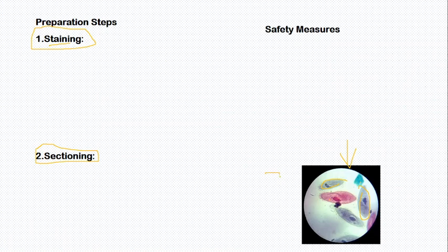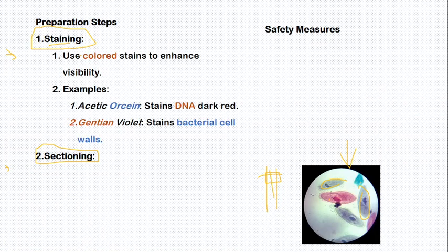you are cutting it to observe maybe the epidermis or dermis. Suppose you cut it wrongly because you don't follow the procedure I'm going to put here. Once you don't follow the staining procedure, you will observe nothing under your light microscope. So what is the function of the staining?